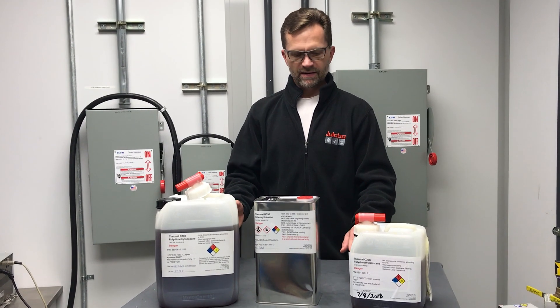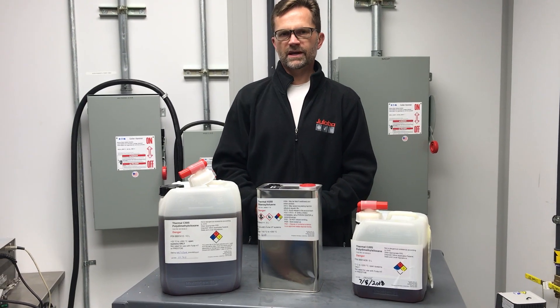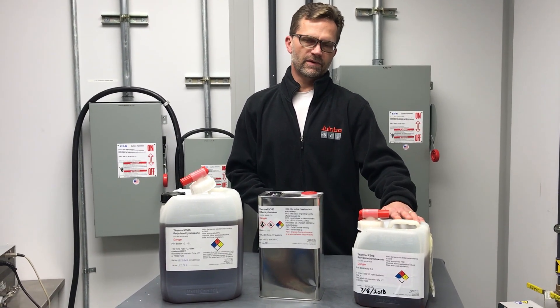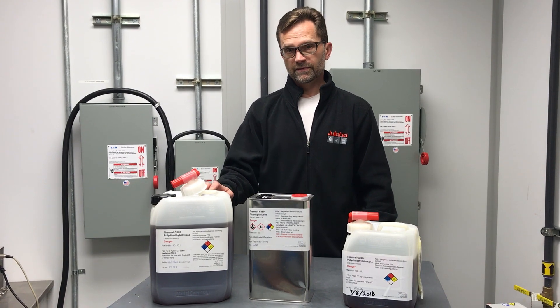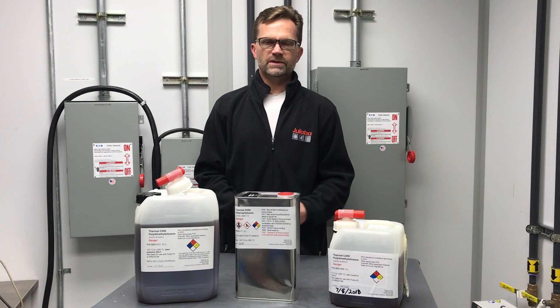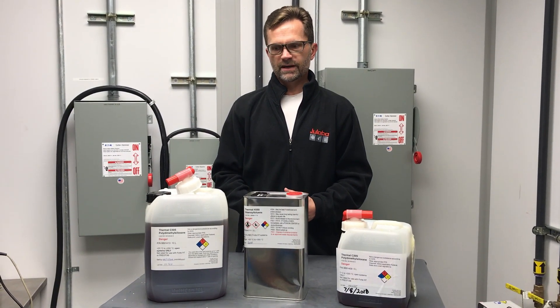As you can see, they are light brown in color, and this is due to an added stabilizer to reduce oxidation at high temperatures. Thermal C20S is good for operation up to 220 degrees C. Thermal C50S is good for operation up to 250 degrees C. Both of these fluids have been tested at those upper temperatures in continuous operation for three months without significant oxidation or breakdown.